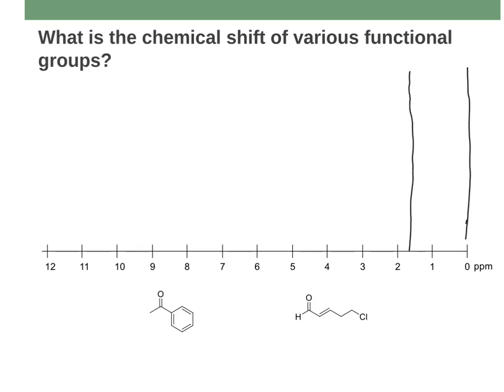So note that this region here is about a 1.5 ppm range. We're going from 0 to 1.5. These are your hydrogens on carbons that are just alkane-like. You're plain, boring. Maybe it's propane, maybe it's cyclopentane, maybe you've got some highly branched whatever, just alkanes, nothing electronegative, no pi bonds, nothing very interesting, just alkane sp3 kind of boring stuff. That's where you'd expect to see those hydrogens.